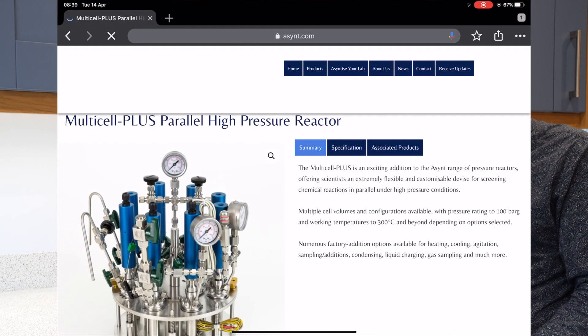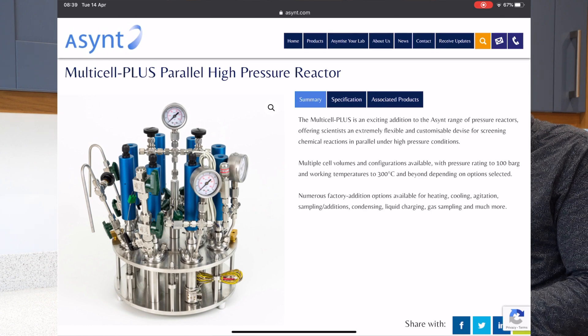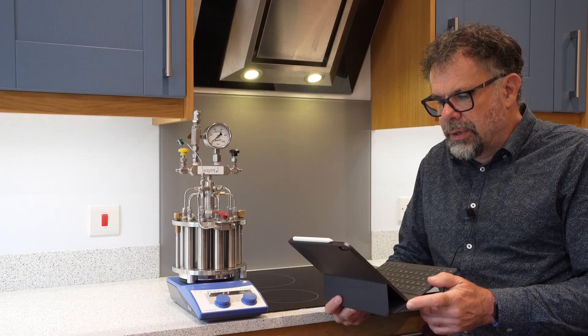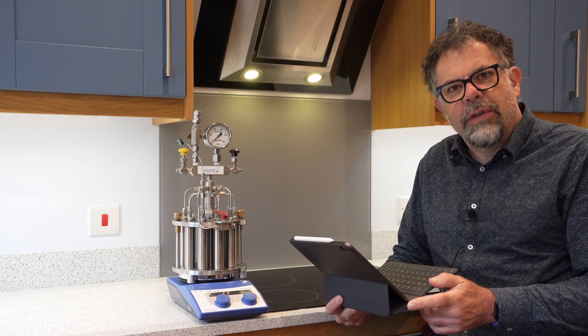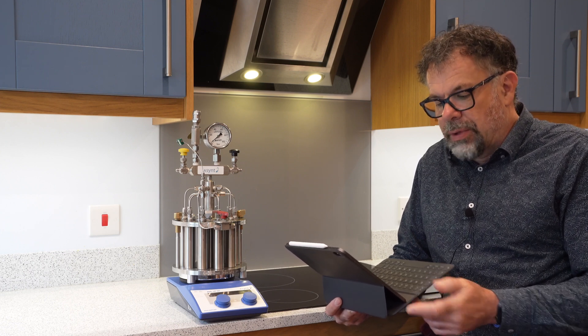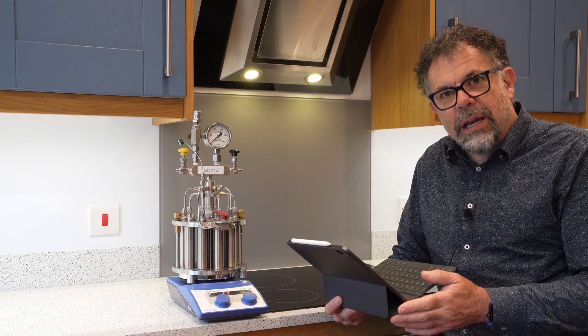Here we have a newer version with more sophistication. This is what we call MultiCell Plus. This particular unit offers reaction volumes up to 100 millilitres, but also many other additions you can add to your device: multiple sampling ports, individual overhead stirring, individual pressure, and individual temperature control — pretty much exactly what you need.